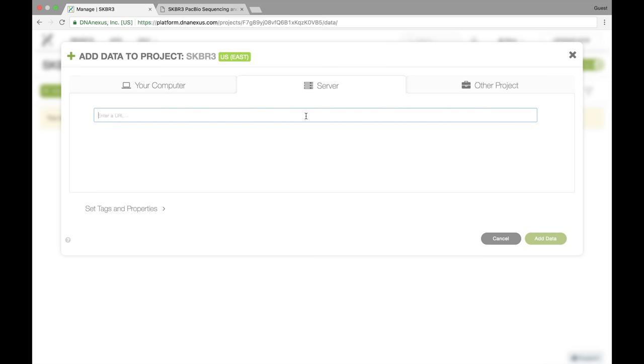So we have some data that's publicly available, and it's on a website, so I'm going to go over there, get the download URL for that data, and then upload it to the DNA Nexus platform here.